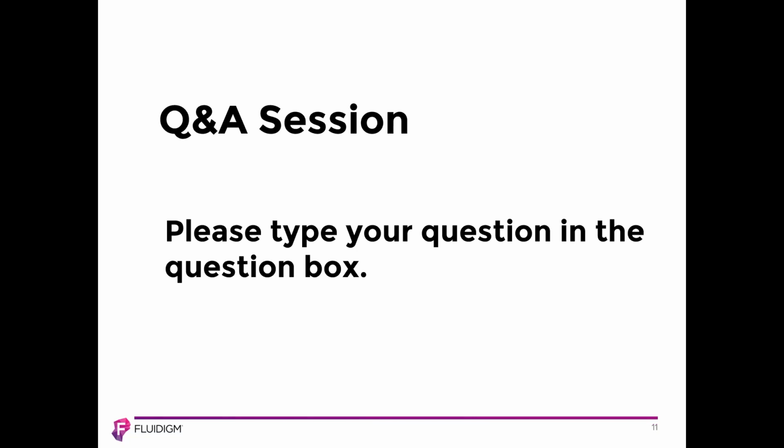Okay, Lindsay, here's an imaging mass cytometry question for you. Do you require iridium as a DNA stain, or does IMC use another method to identify DNA? Okay, so yeah, for IMC, we do recommend using the iridium intercalator as well. And so for our IMC experiments, yeah, we definitely suggest adding that stain after you've included your panel. However, there are alternatives like antibody-based markers that you can use, such as histone H3.